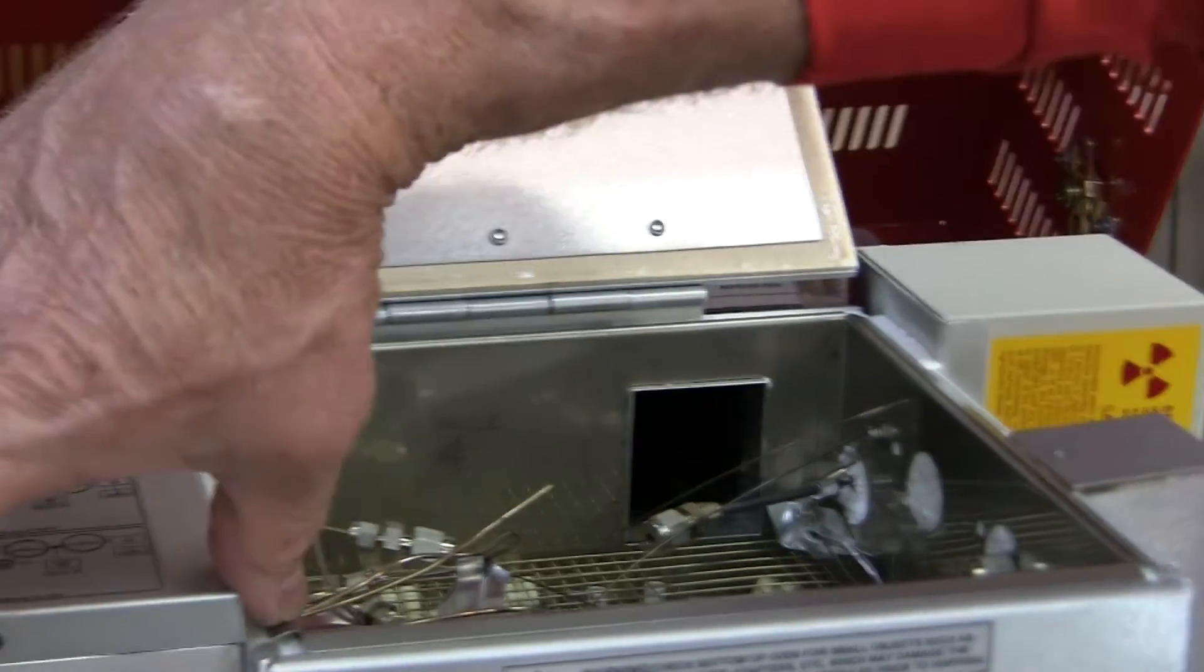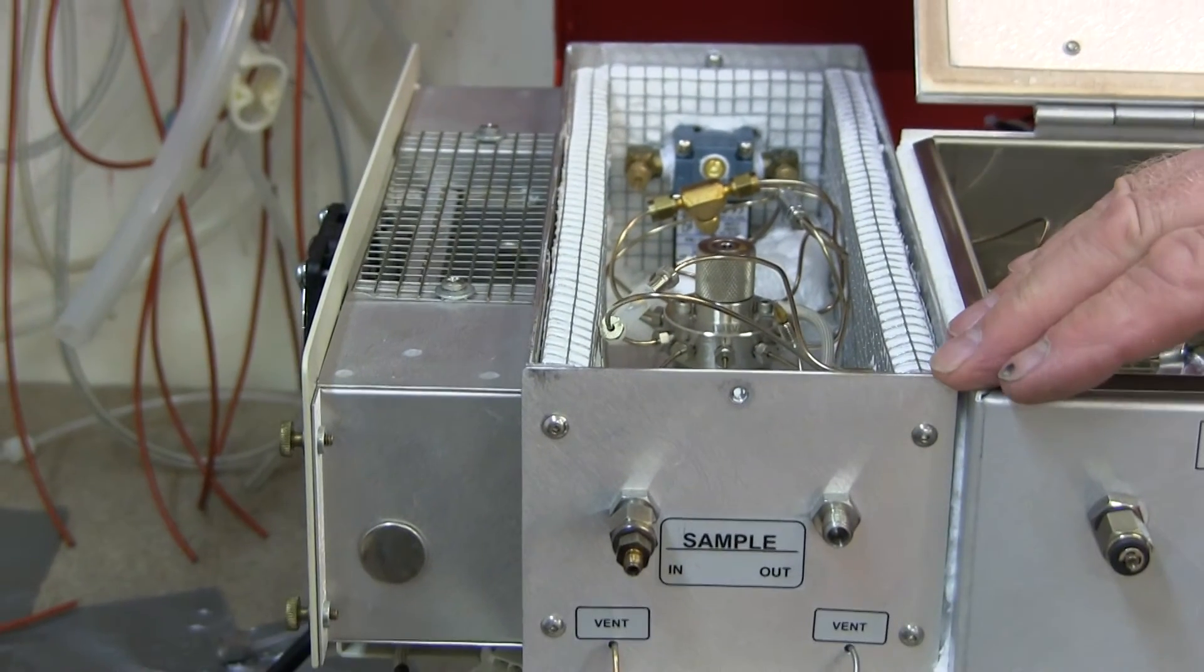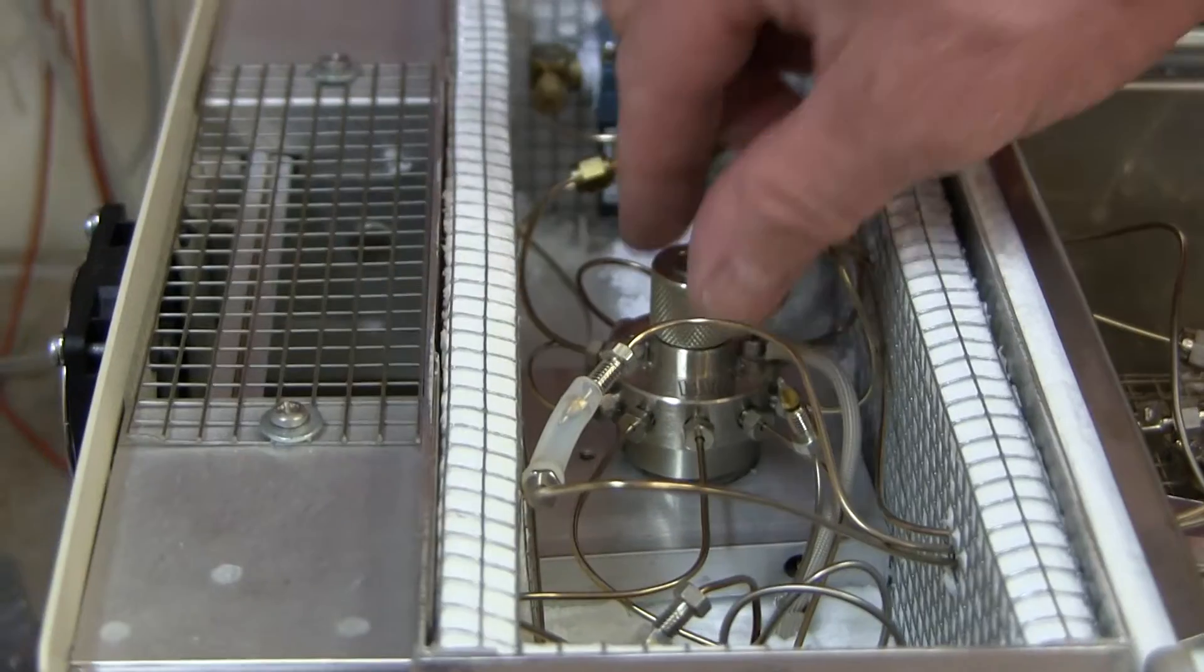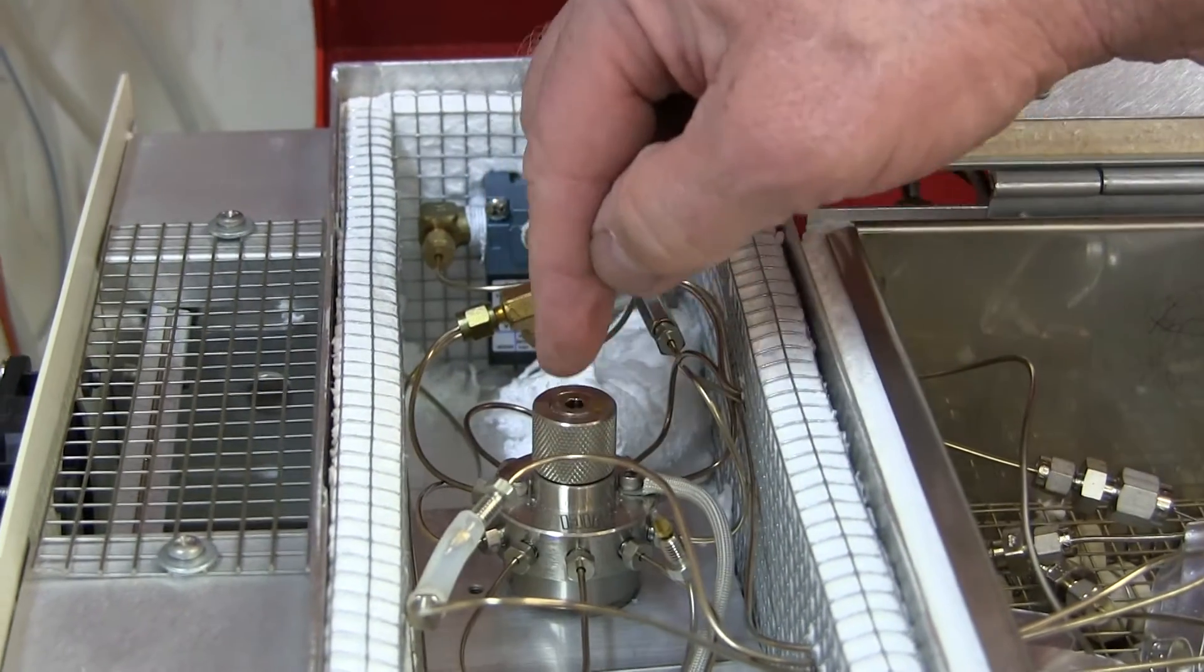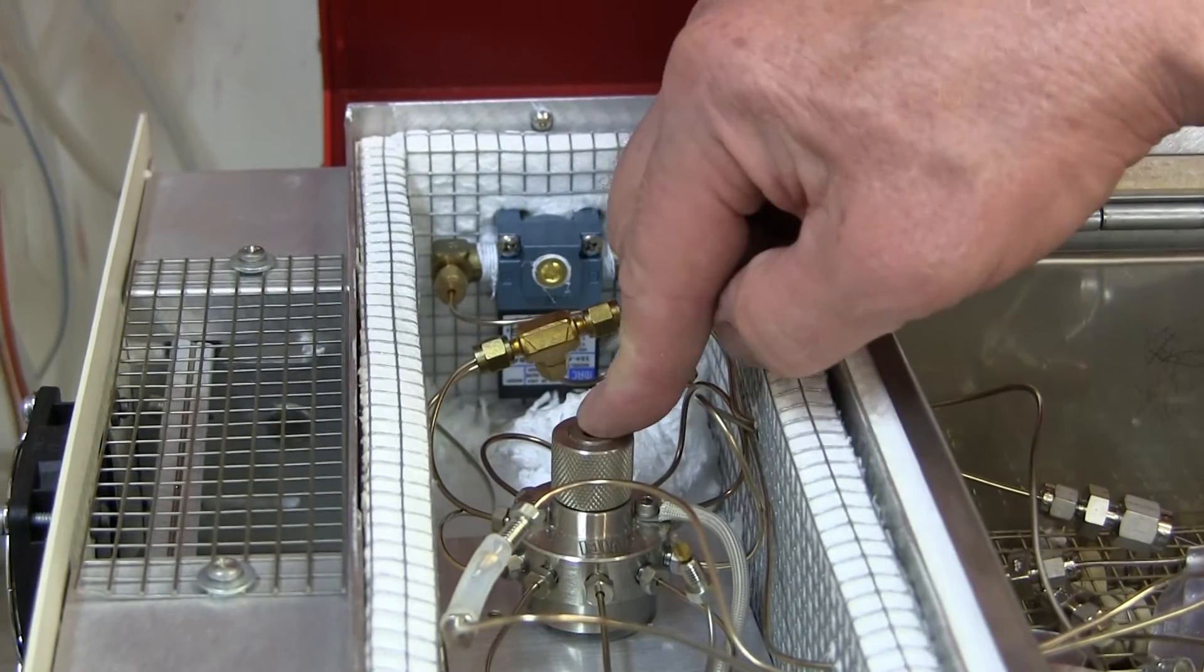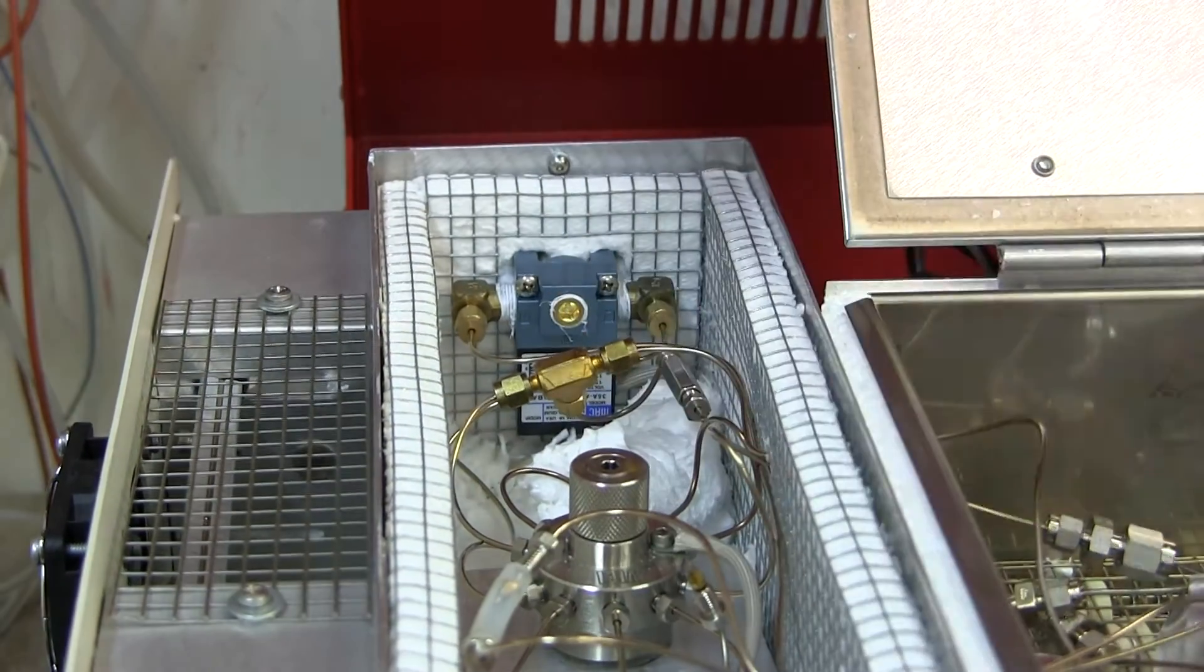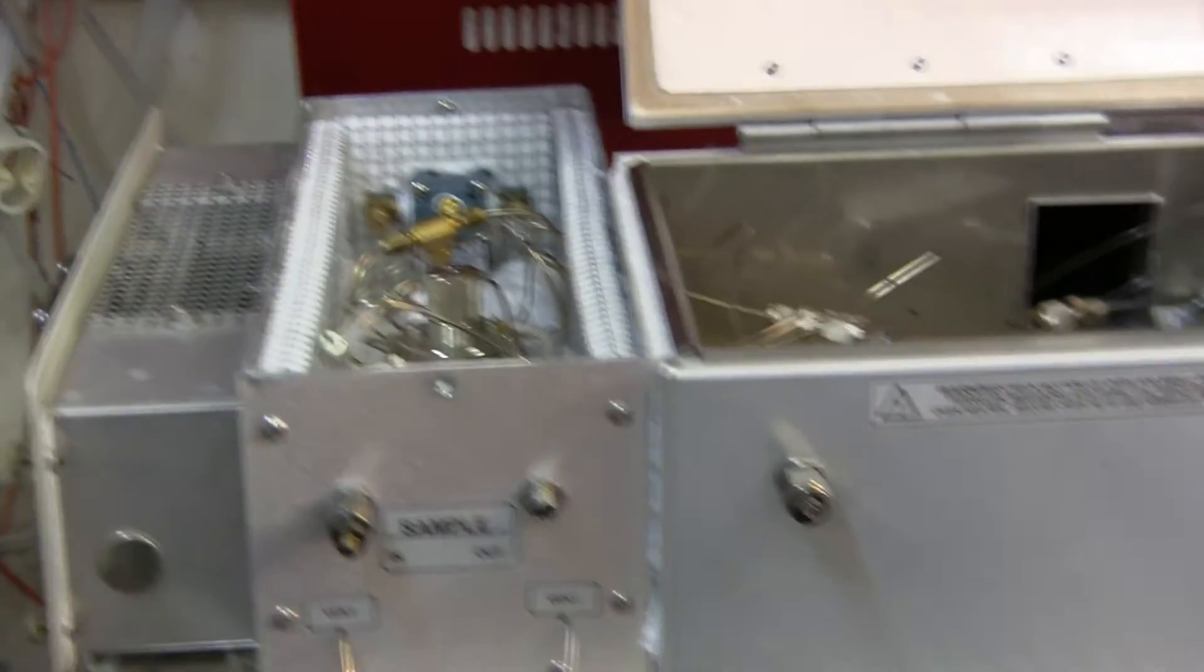This is the valve oven. Some GCs have this valve oven and some don't. It's another option that you order depending on what it is that you want to measure. This is a valve that does a gas injection of whatever is in a tube called a loop that's connected to the valve. You can have up to three valves in this valve oven. The valve oven is also controlled by the front panel temperature controls.